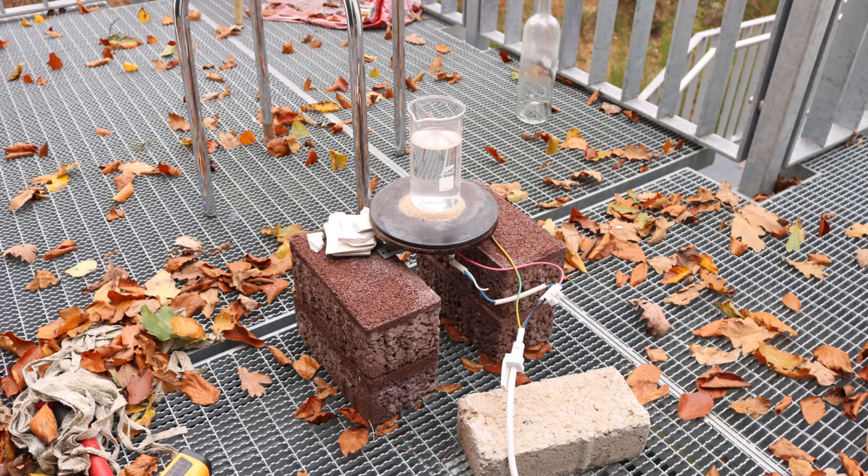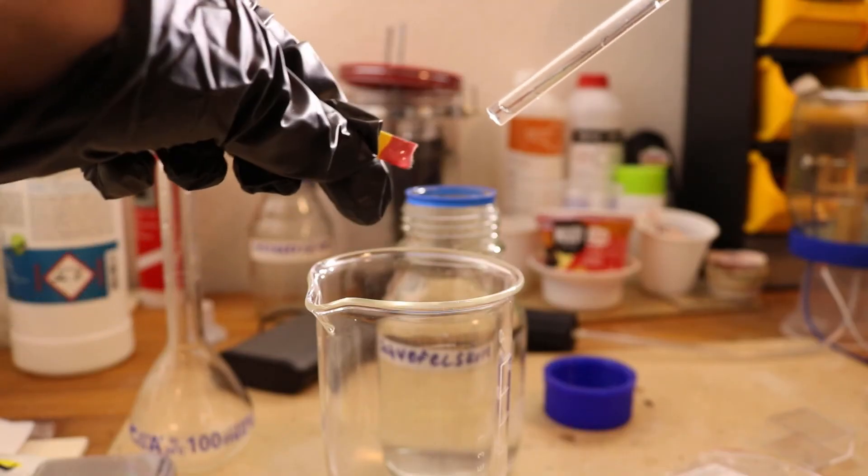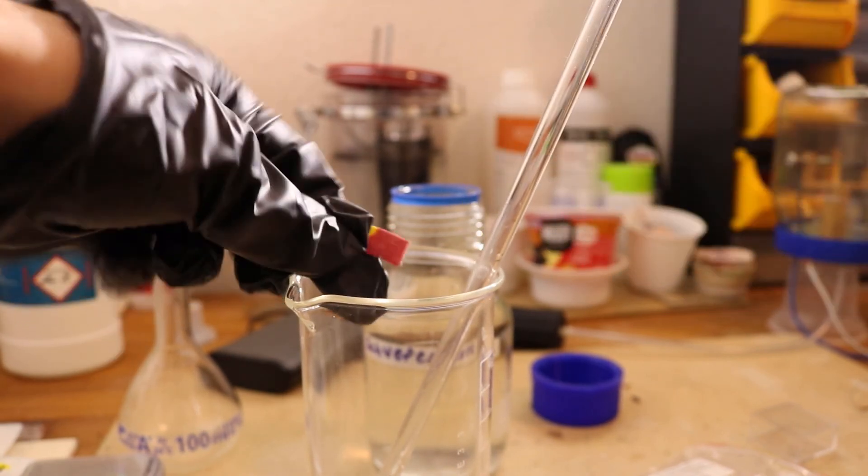Sulfuric acid has a boiling point of 337 degrees Celsius, so in theory we can heat it up that much to drive off the water. First I wanted to heat the beaker with the acid on a hot plate, but I think you can see why that would be terribly inefficient. So I just put it in the microwave — not the best option since you put food in there as well, but as long as it's not getting too hot only water should be coming off. At the end I just boiled it down so the liquid could fit into my flask. With the pH paper you can see that it's strongly acidic. I don't really have any use for it but I just wanted to make some to explore the chemistry.